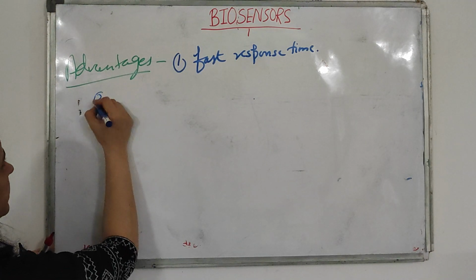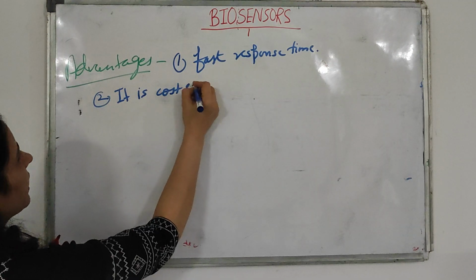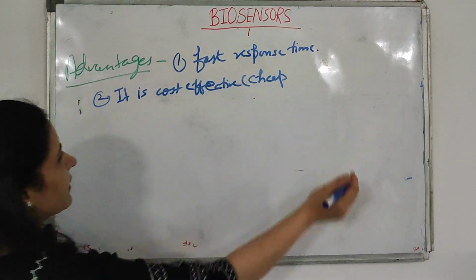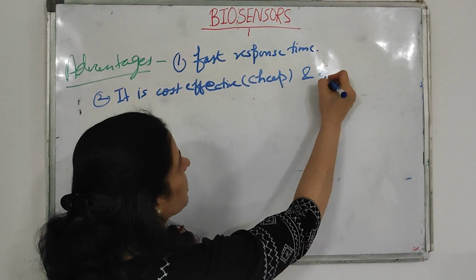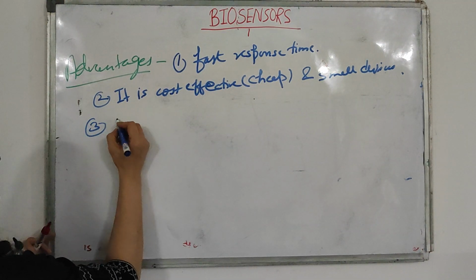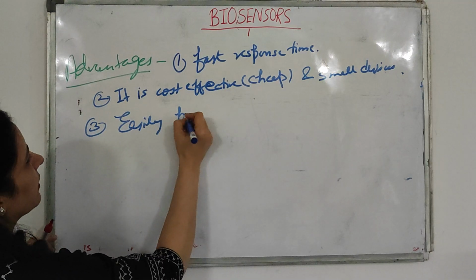Second, it is cost effective. That means cheap. It is not a very costly device. It is cost effective and small. Third is that it is easily portable.